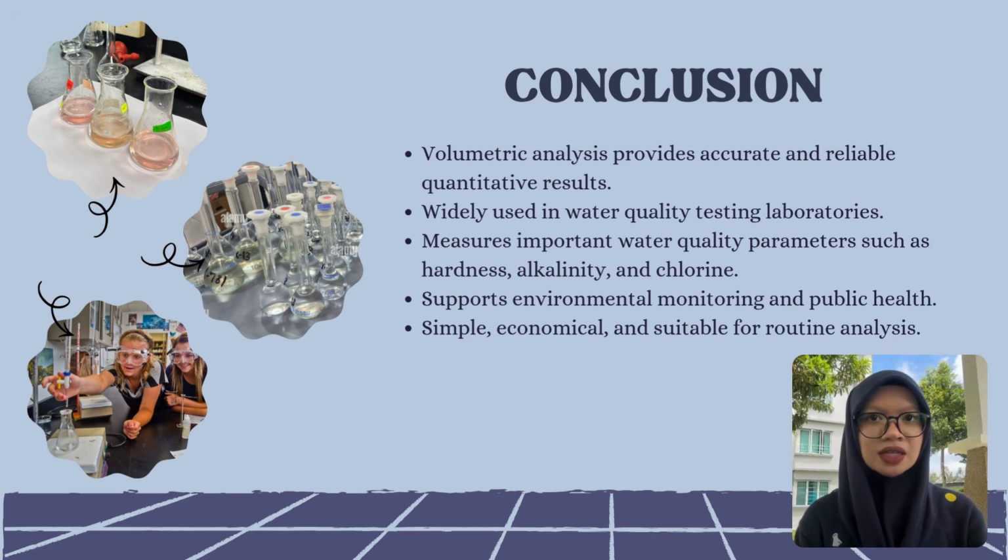In water treatment plants and environmental laboratories, volumetric analysis is commonly used to measure water hardness, alkalinity, chlorine concentration, and other important chemical parameters. The results obtained help to ensure that water meets safety standards before it is supplied for drinking, agricultural, or industrial use.